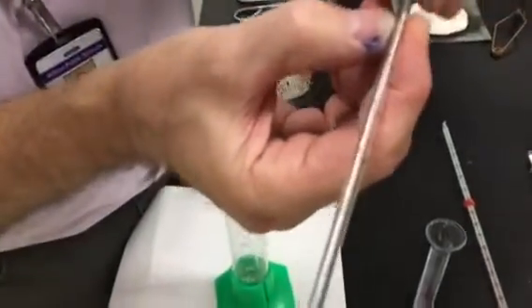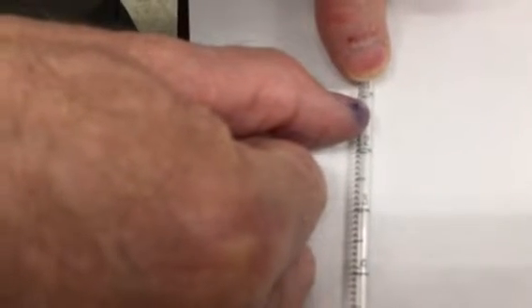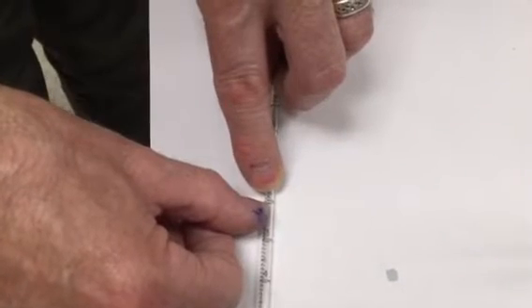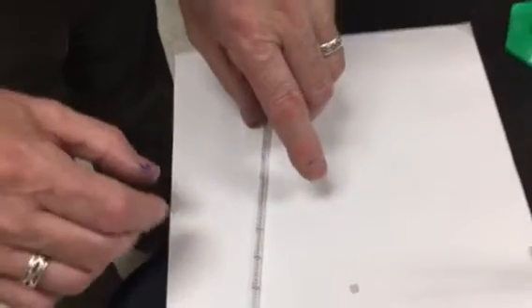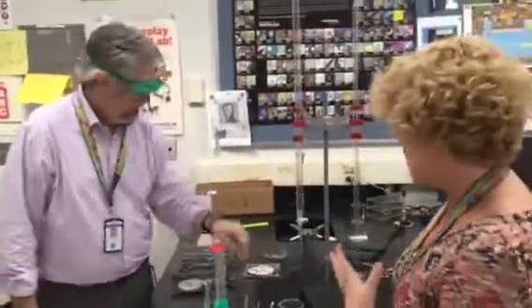This is really interesting. This is my favorite pipette. Hint, might be on the assessment. This is 0.1. That line is 0.1. That line is 0.2. So that first line you see there will be 0.11. That's 0.12. So this scale can give me 3 places after the decimal. So if it's right on that line, it'll be 0.200 milliliters. It measures out to the thousandth place of a milliliter. And the only way you know that is if you look at the scale marks prior to even doing any measurement whatsoever. You have to leave space for that last estimated digit, okay?